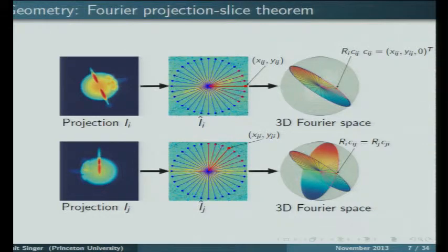All the spokes, the blue and red spokes. Those are the values of the Fourier transformation, or at least the amplitude. So what are the spokes? This is the amplitude of the Fourier transform, and this is a line where the two agree. Oh, so it's just a point of reference for the orientation? Yeah. Okay. Sorry if it's confusing.